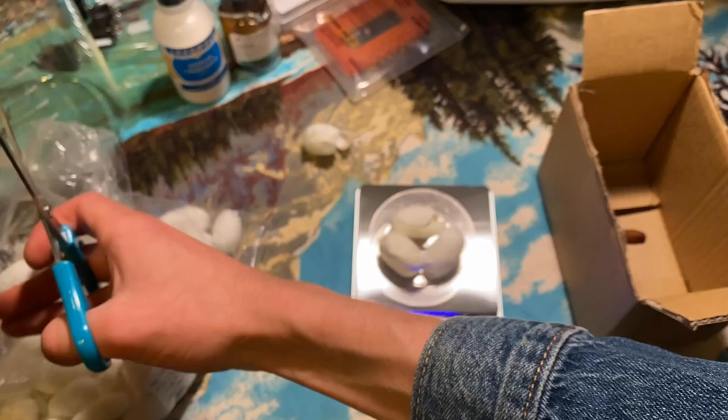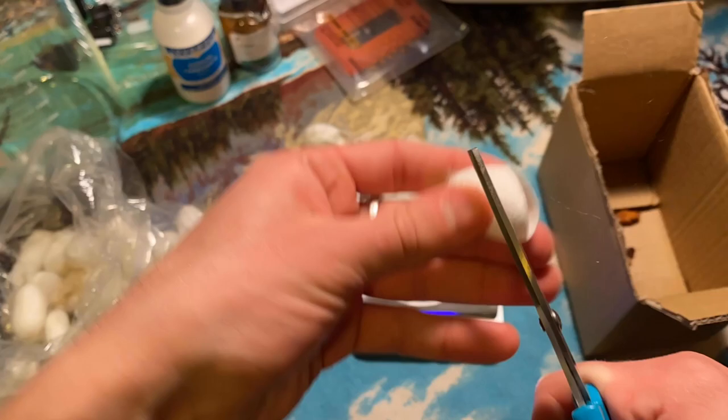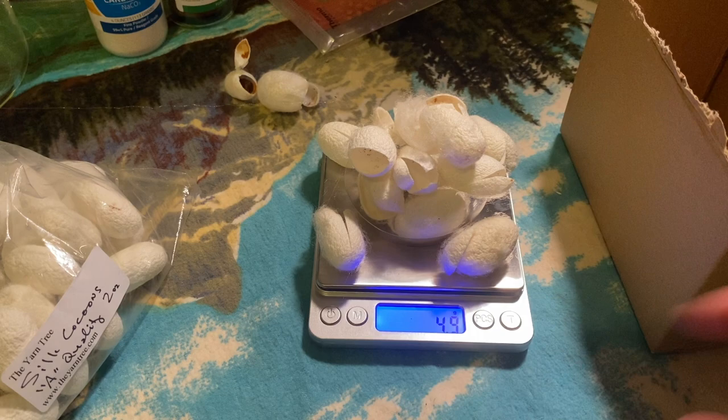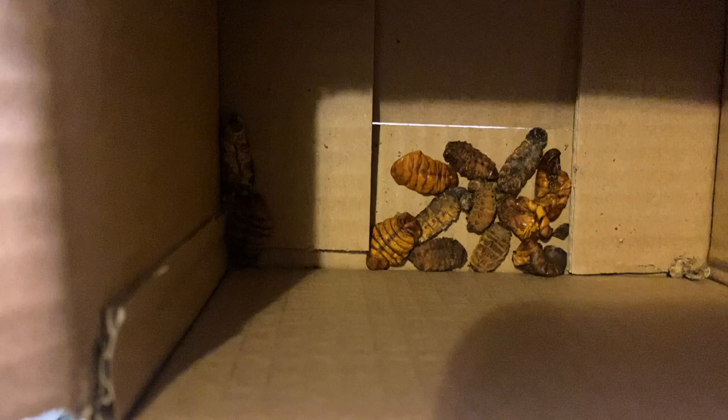Some cocoons had a bit of brown residue and weren't used. After removing the worms, I weighed out about 5 grams — roughly 10 to 15 cocoons in total. Here are all the worms that were collected; they look gross.